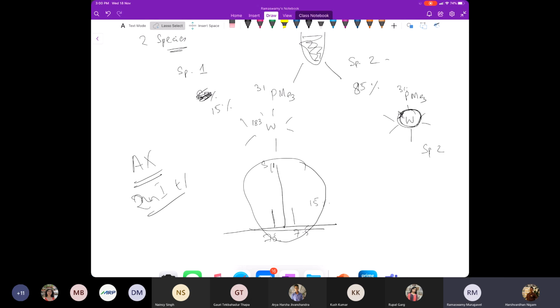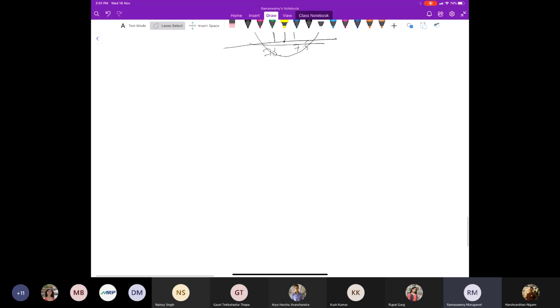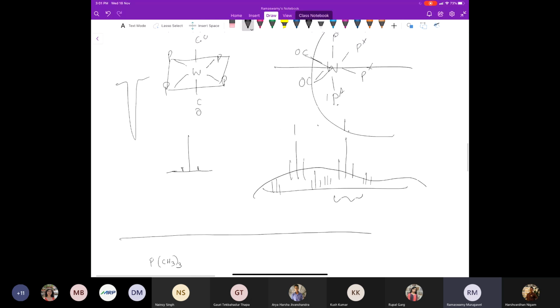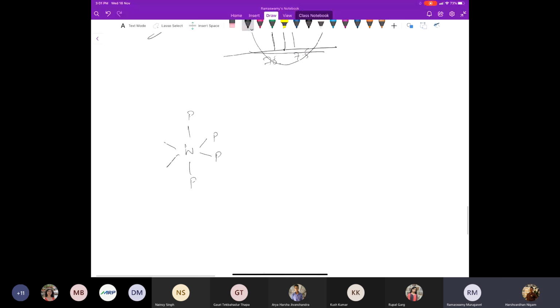Okay, now go to the more complex one. It's not that complex, but I'll do the other one. This example, that's where I think you have a little confusion. This example, I'm redoing it. So this is axial, this is equatorial, right? So it's essentially an A2X2 pattern. You know what an A2X2 pattern is, right? It's two triplets, right?